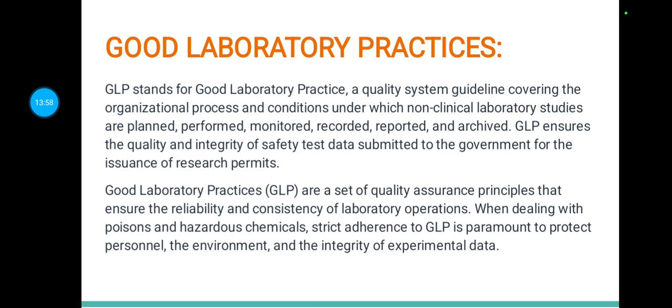GLP or good laboratory practices are a set of quality assurance principles that ensures the reliability and consistency of laboratory operations. When dealing with poisons and hazardous chemicals, strict adherence to GLP is paramount to protect the personnel, the environment, and the integrity of experimental data.